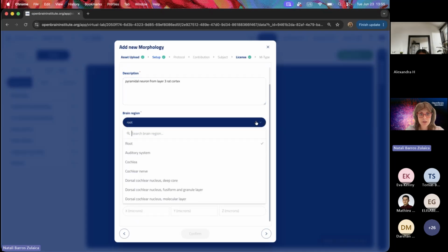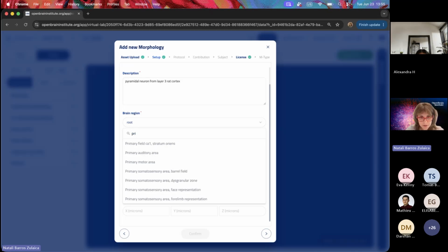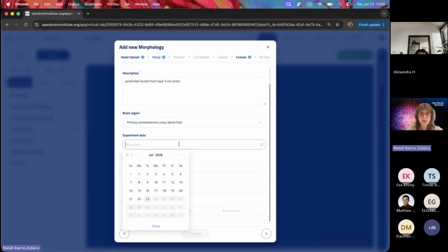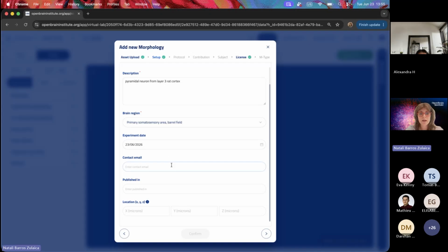So the brain region, I said it was primary somatosensory barrel field. Experimental day, this is not mandatory, let's say today. Contact email is not mandatory either.